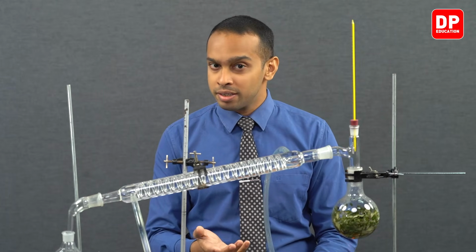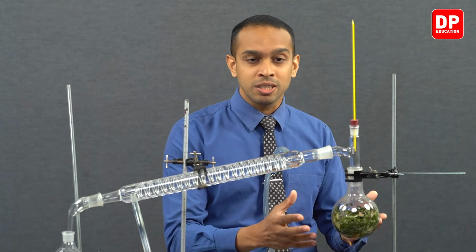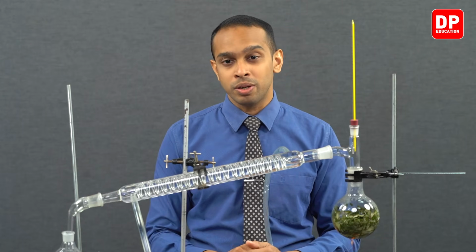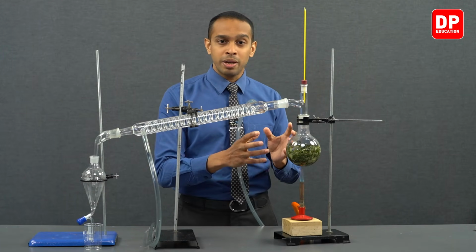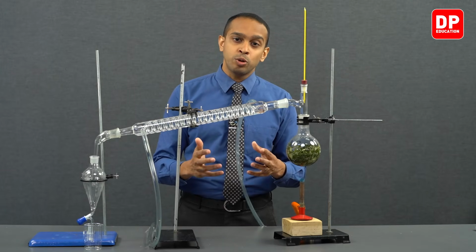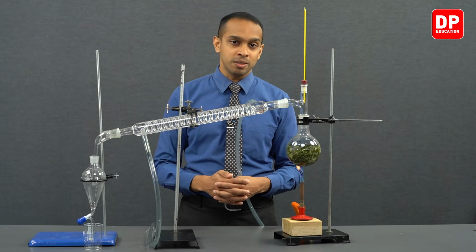Water boils at 100 degrees, eugenol boils at 254 degrees Celsius. However, you can see that this mixture starts to boil at a lower temperature than both of those temperatures, which means a lower temperature than even 100 degrees Celsius. So this is beneficial to us because when you are heating eugenol all the way up to 254 degrees Celsius, before it boils, it can undergo decomposition.